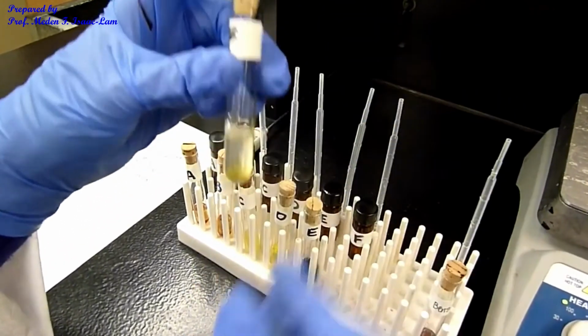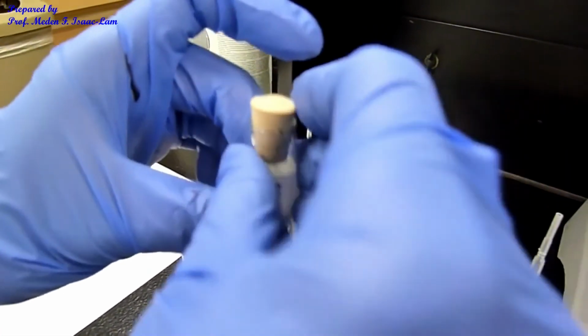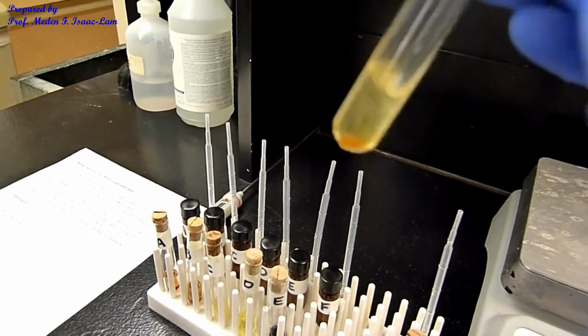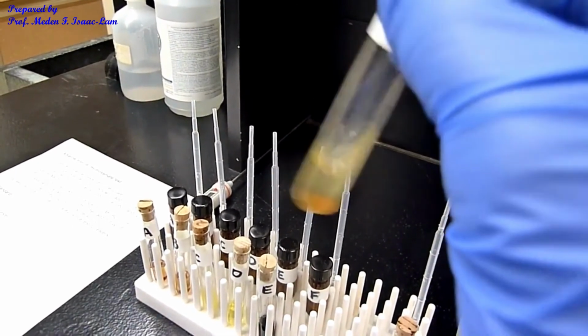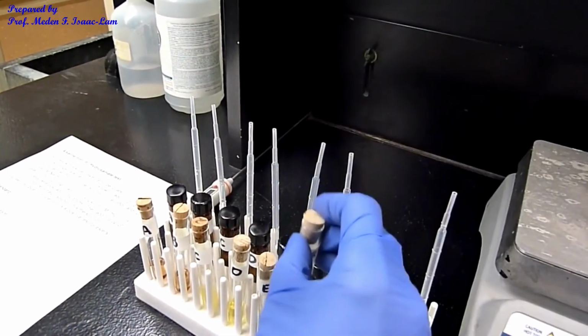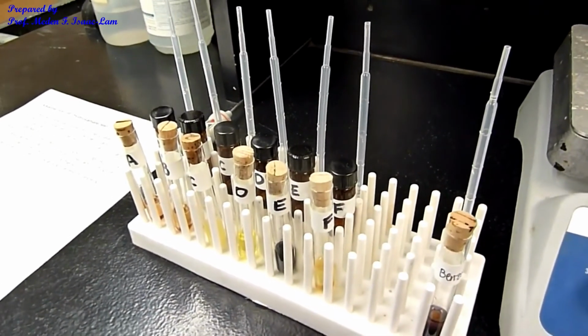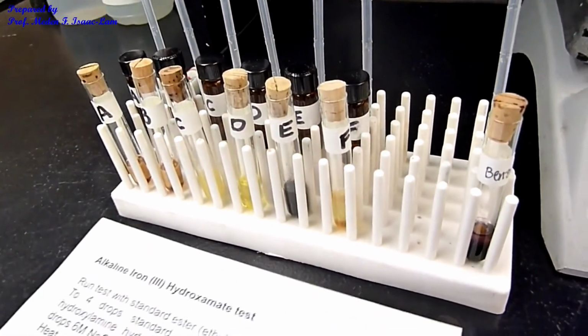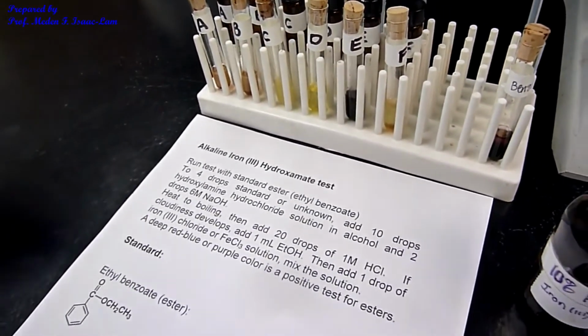So F stayed yellowish. So no formation of a complex with iron chloride in the presence of hydroxylamine. So that's our test for the presence of an ester.